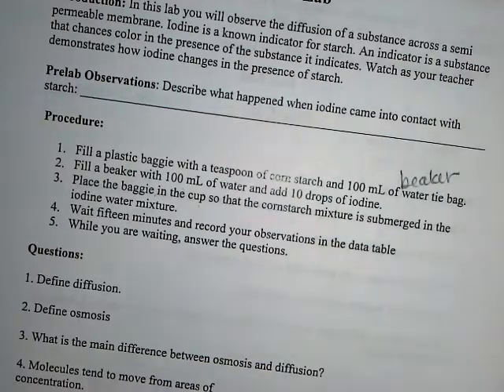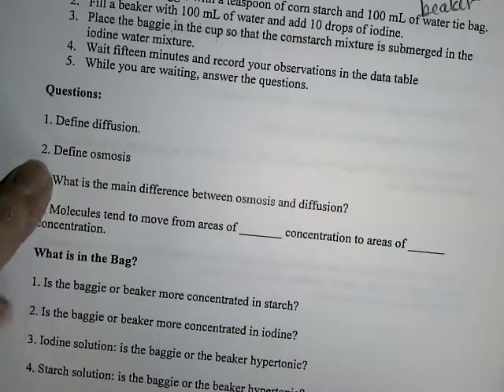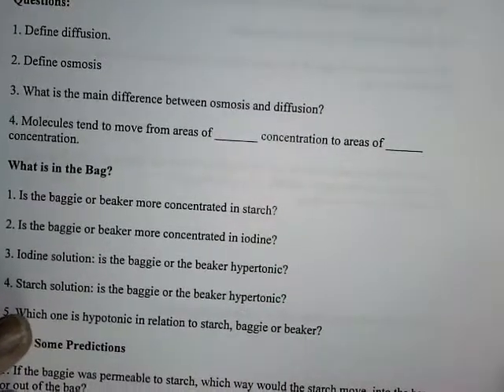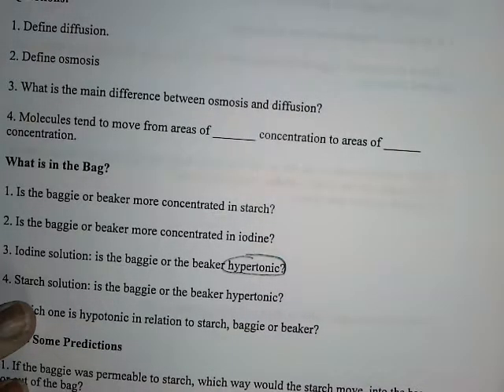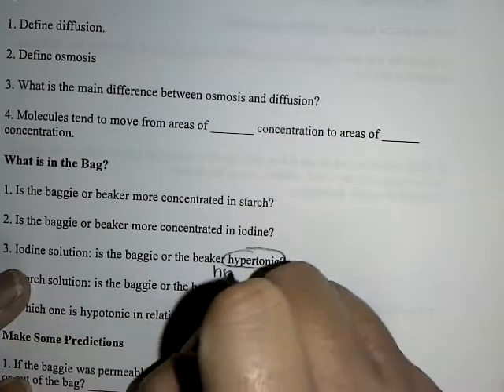While you're waiting, answer the questions. So I want you to go through what is diffusion, what is osmosis, what is the main difference between them, and kind of talk about that kind of stuff, okay? So go ahead and answer those while you're waiting for your 15 minutes. Now, there's a vocabulary word I need you to think of. I want you to circle the word hypertonic. Hypertonic is just a real big fancy word for saying that this is high concentration.